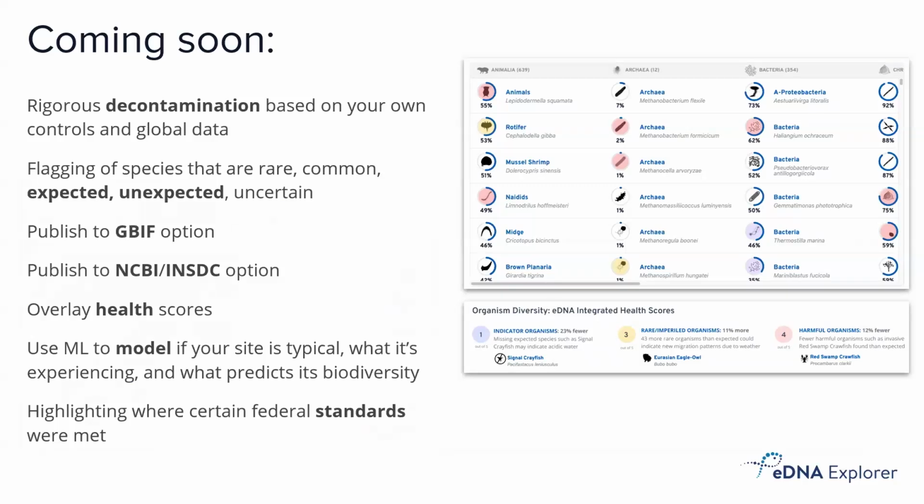We are planning to help you publish to GBIF directly here and to help you publish to NCBI. So we're a temporary holding ground of about 3 years. You can trust that your data will be able to stay on the site. Hopefully we can extend that to be longer, but we would love for you ultimately to put your data in other long-term archives.